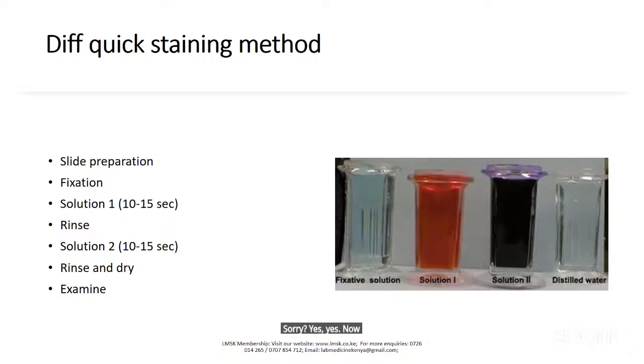Now you are in histology. How do you go about it? Is it a thin or a thick film? Thin. Like that one of a malaria parasite? The way we prepare slides for FNAs, just putting a drop, but mine are cells. Then you use another slide and squash.